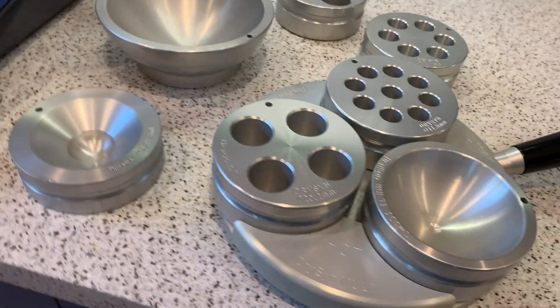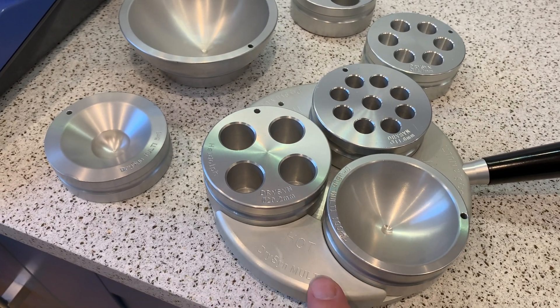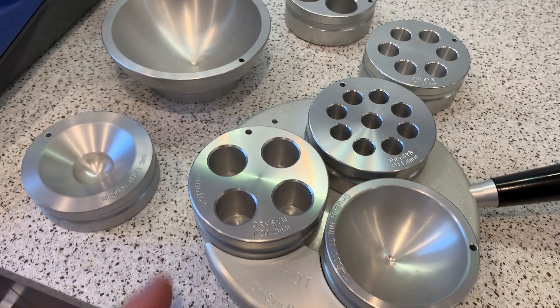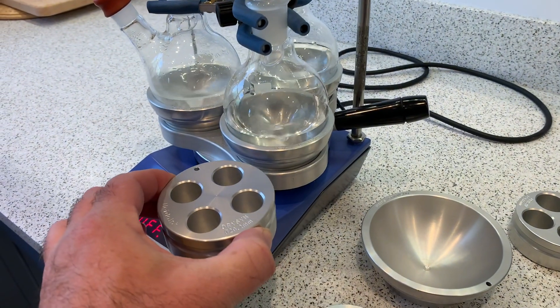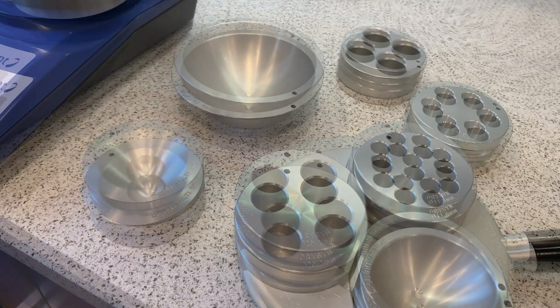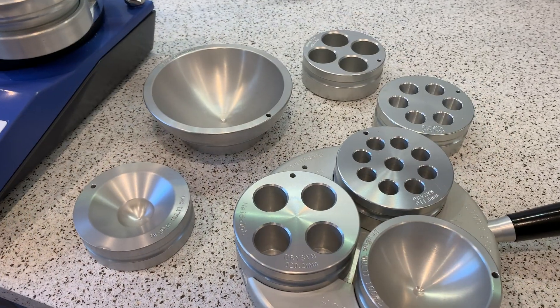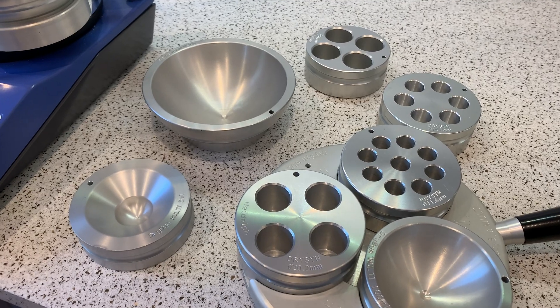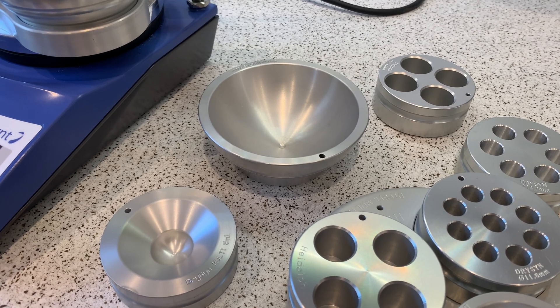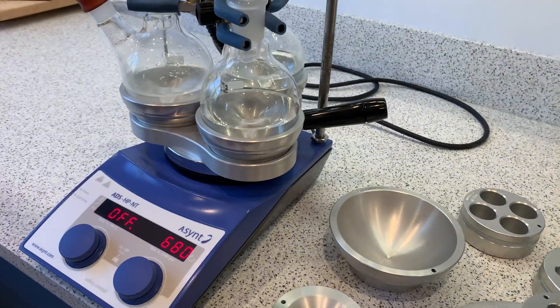Over here we have some of the other options available. This is a smaller Driesing Multi unit — this is the Multi-E — and it works up to 100 millilitres in parallel. These inserts will also fit on the Multi-S and the Multi-M, and we can do multiple tubes of different configurations. We have many standard options available and in stock, but we can also do custom sizes. The largest size in terms of round bottom flasks is 500 millilitres, and the smallest is five millilitres — all available on the same base units.